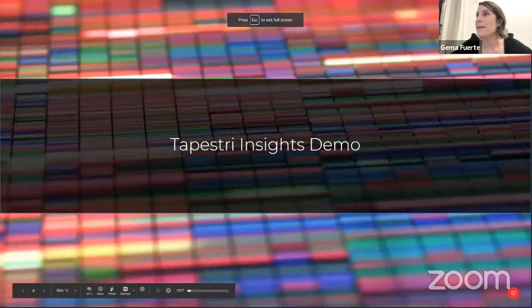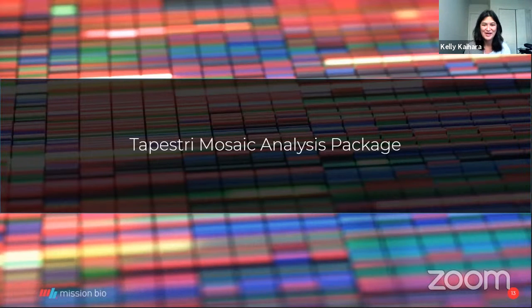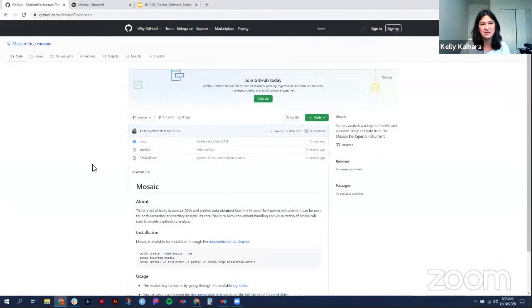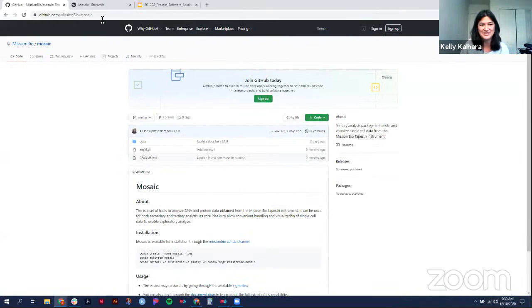All right. So Hema did an amazing job taking you through the Tapestri Insights software. And so my job is a little easier, explaining what the Tapestri Mosaic analysis package is. Mission Bio has our own GitHub page, so you can go to github.com/missionbio, and there you'll find our Mosaic analysis package along with other data analysis tools. This is based on Python code, and we use Jupyter notebooks in order to execute the code. So you go here to install the package and upload your sample.